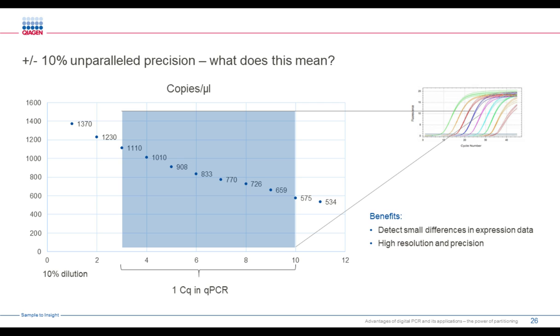By looking at it with digital PCR, you are able to see these small differences in a much higher resolution, and they can have a significant impact on the biological response. Of course, when it comes to normal gene expression in qPCR, these small differences may not be biologically relevant, but hey, this is up to you to decide.